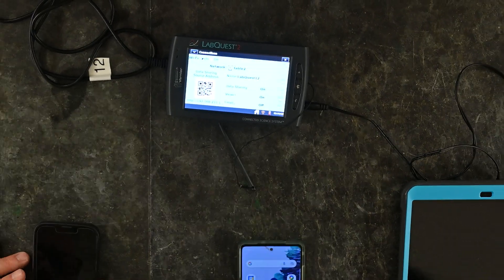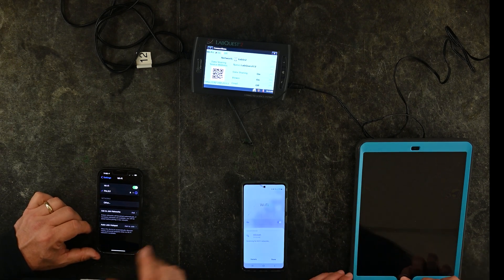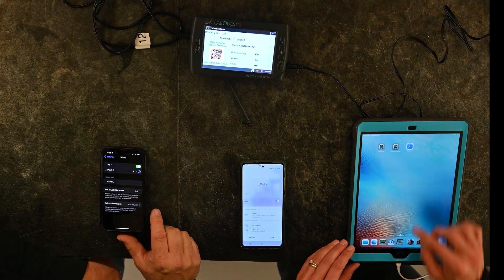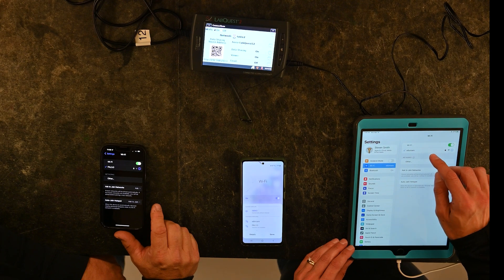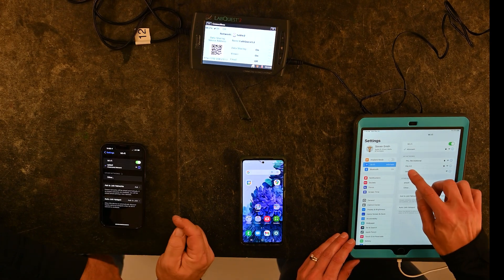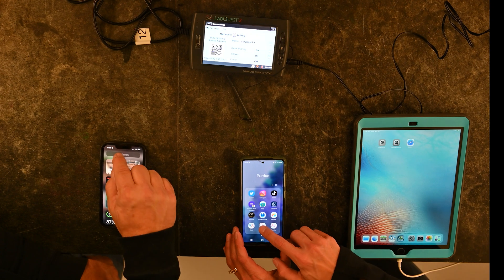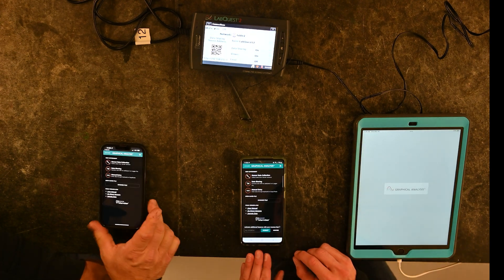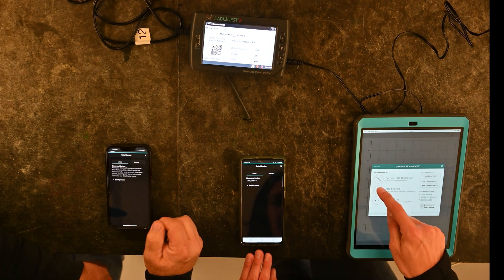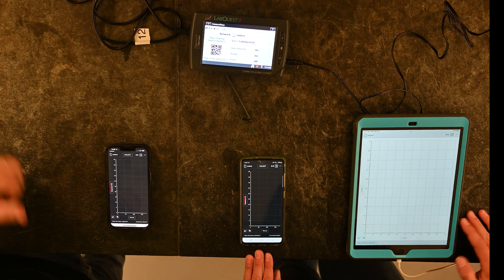We're going to show you this on three different devices. Go into Wi-Fi settings on each device and look for 'table 2'. Once you see table 2 and it shows as an unsecured network, go into the Graphical Analysis app. There are three options — choose the second one, 'Data Sharing', click on it, and you should see LabQuest 12 come up. Click on LabQuest 12 and you're ready to collect data.